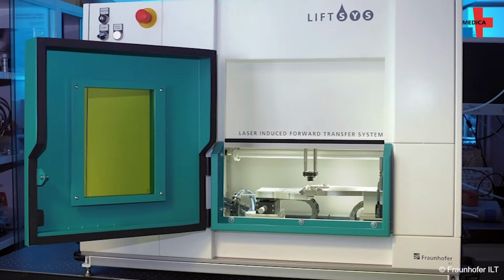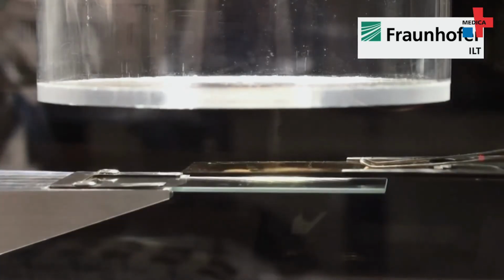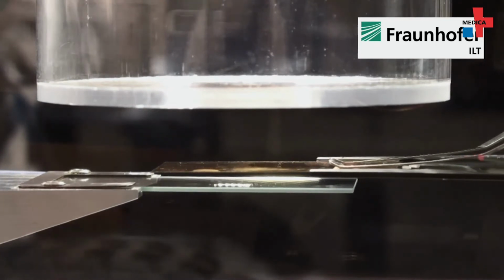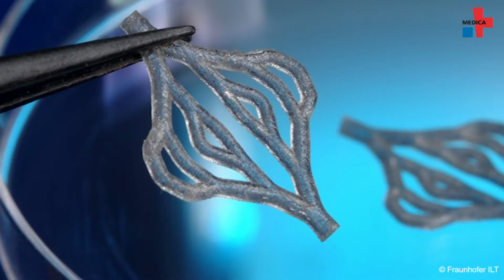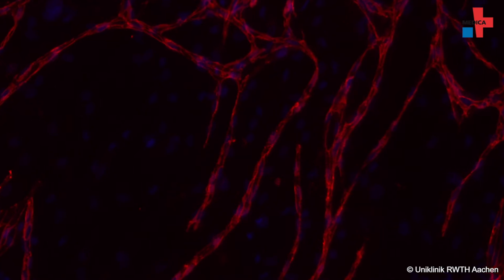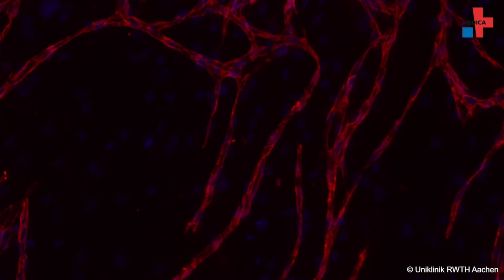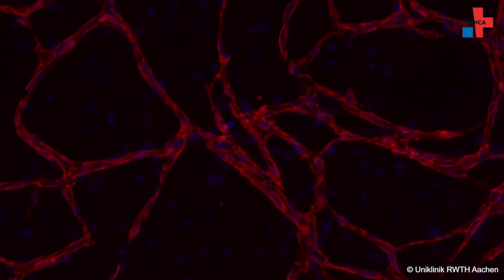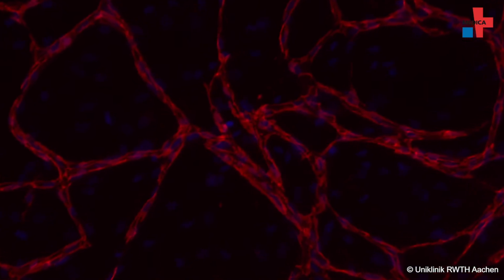Stereolithography is a process where we cross-link polymers to print scaffolds, which can be used for implants. The special thing in this process is that we use new, not common laser sources, allowing us to use other polymers and materials. One of the fields of application is cardiovascular tissue engineering. In a joint project, the Fraunhofer ILT and the University Hospital RWTH Aachen are working on the manufacture of heart valves.